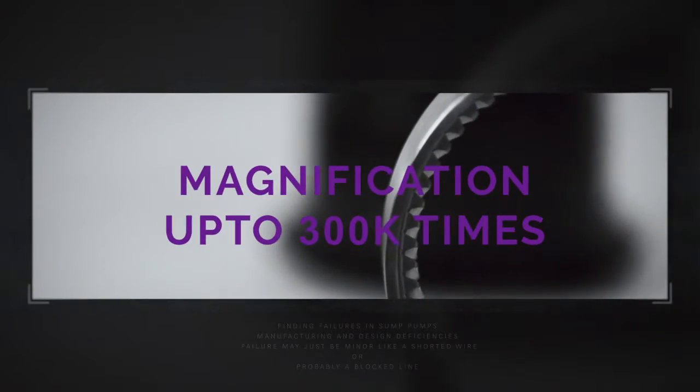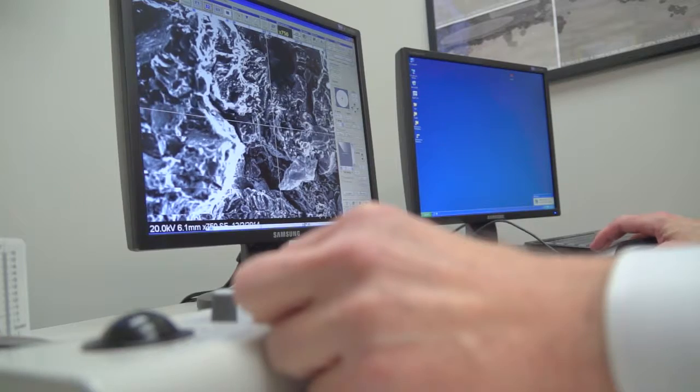SEM, a Scanning Electron Microscope. It's a machine which allows us to examine and expose the features of the fracture surface on any surface with a great magnification, up to, if needed, 100,000 times, 200, even 300,000 times. Usually we operate in a range of 5 to 10,000.